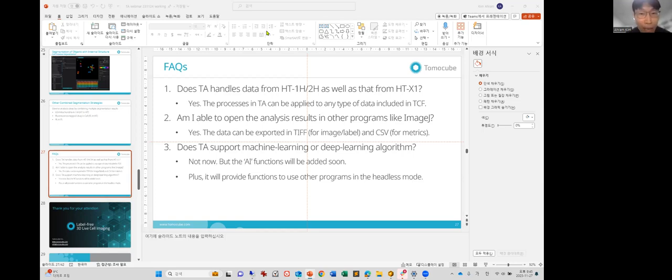And also, Mariana Kunze asked, if the fluorescence signal is only at the perimeter of the organelle to segment, e.g. at the membrane, can the fluorescence tagged object workflow handle fluorescence of that sort, or does the fluorescence have to be present throughout the interior of the organelle? I'm asking because of the segmentation of yeast vacuoles.